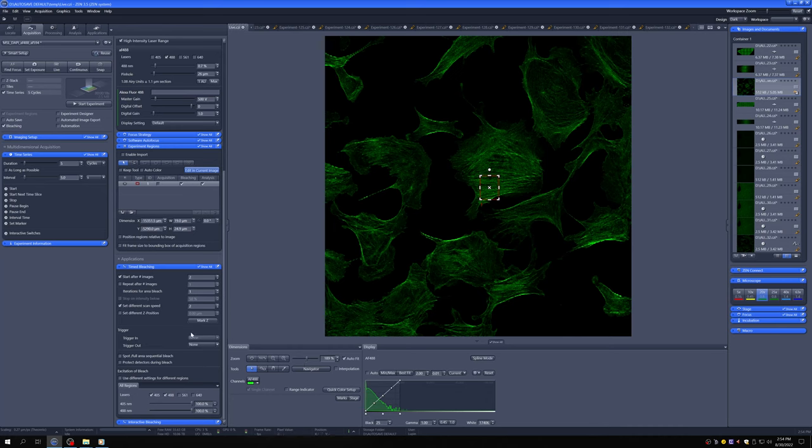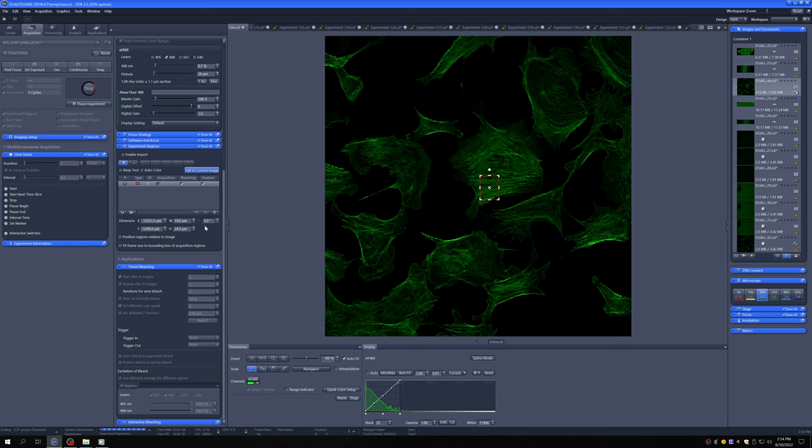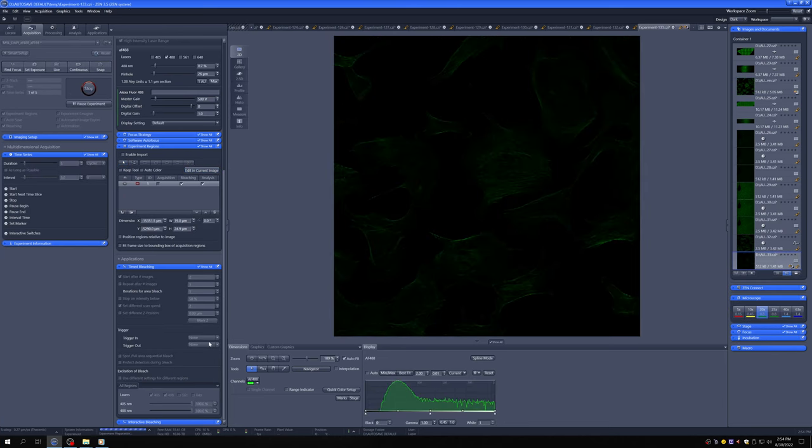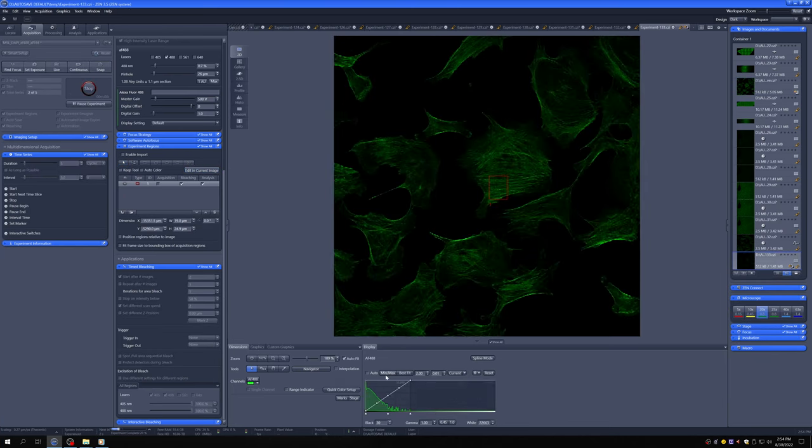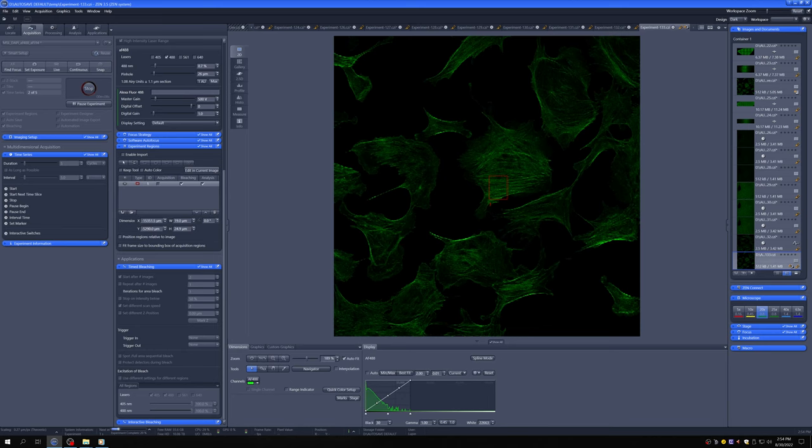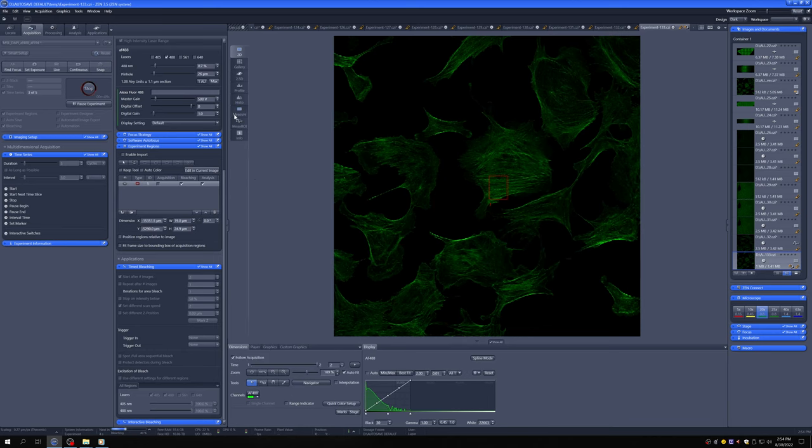Once you have them set up, and I've played around with it a little bit to make sure that this will cause some bleaching, you say start experiment. And so what will happen in the way I have it designed is it'll take two images and then it'll do the bleaching, and we can see here in mean ROI the measurement of the intensity in that ROI.